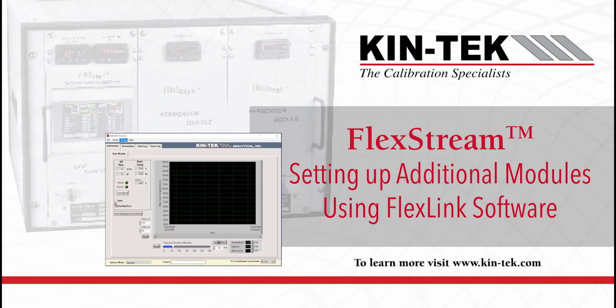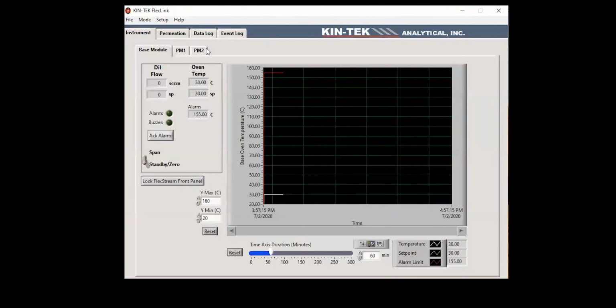Today I've connected to FlexLink and I have three modules that I'm working with. With the FlexStream system, our FlexStream permeation system, we can include up to 6 modules in a series, and then we can operate those modules remotely using our FlexLink software. So today I'm going to quickly go over a couple of the modules that are connected to each other.